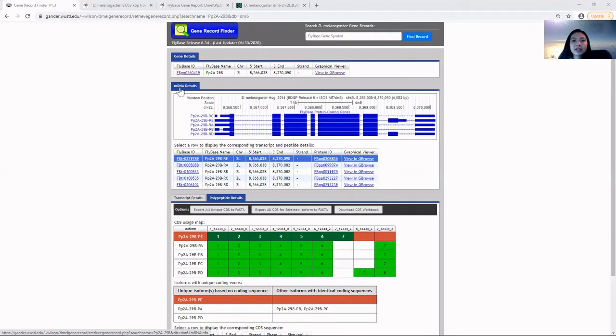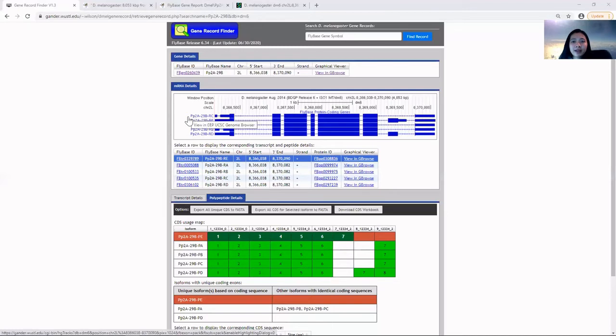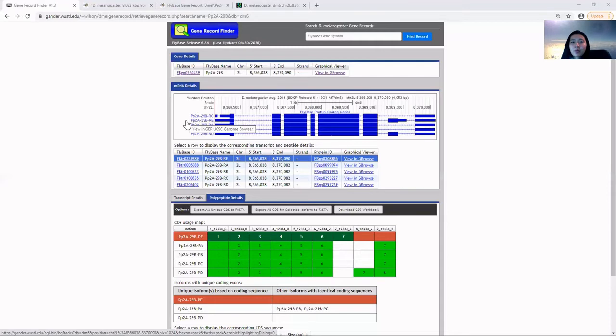In the mRNA details section, the gene structure of PP2A-29B illustrated in D. melanogaster shows five isoforms, all going in the positive direction. What is an isoform?